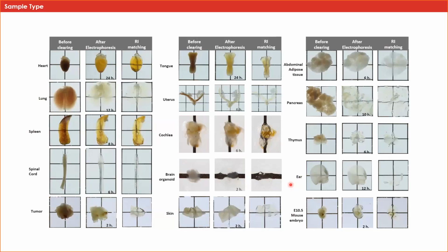So if we go back to our example of imaging a whole mouse liver, suppose that rather than a confocal microscope, you have access to a light sheet, which potentially could scan and image a whole mouse liver in a reasonable amount of time. And you're studying a fatty liver disease model, and the mouse is relatively old, say 12 to 15 months. While the light sheet may provide the ability to image the entire liver, the amount of fatty tissue and fibrotic tissue that is accumulated with the aging may limit the size of tissue that can practically be cleared without substantially altering the tissue's structure.